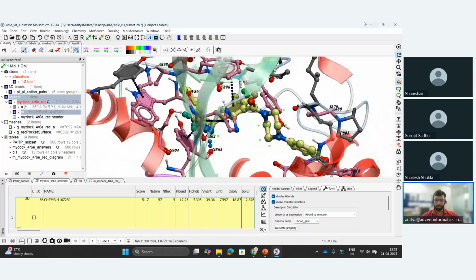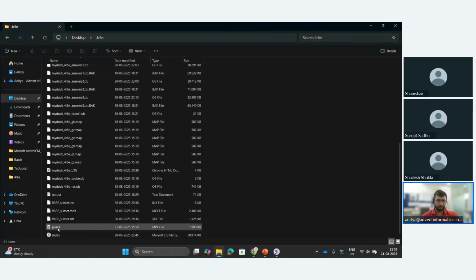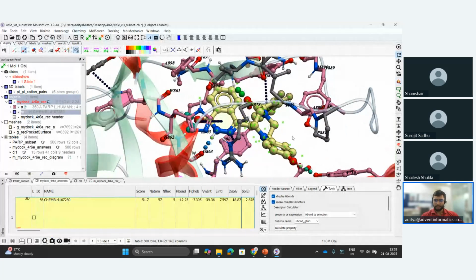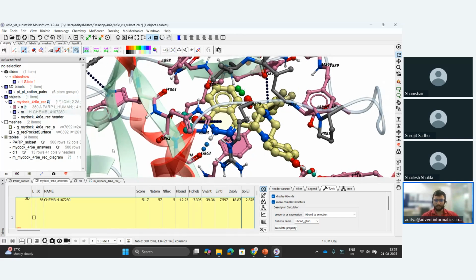And when I go to the same folder, I have the video here, pose 1, right? I can play it, but it might hang the meeting site. Okay. Next up, you remember we made some slides and such things, right? So what is the use of that?